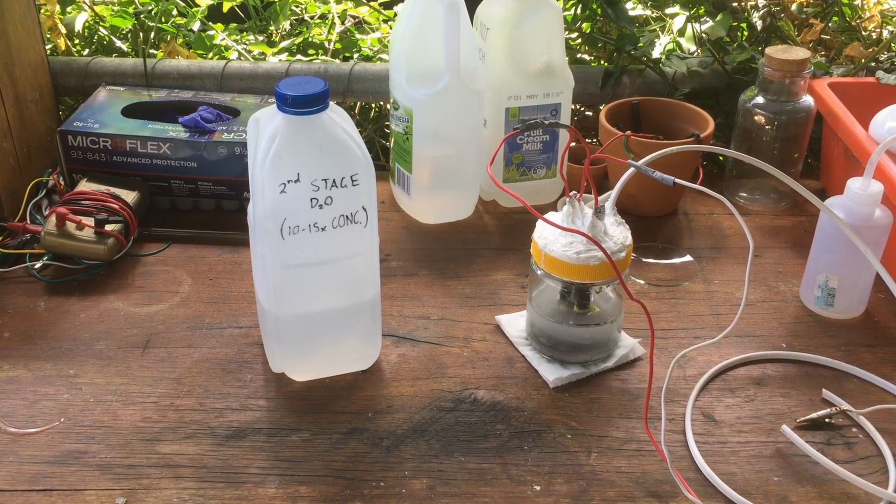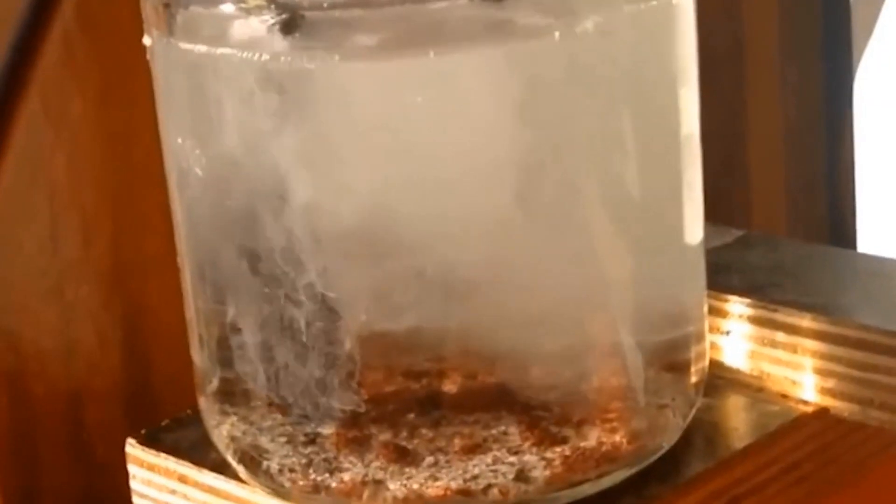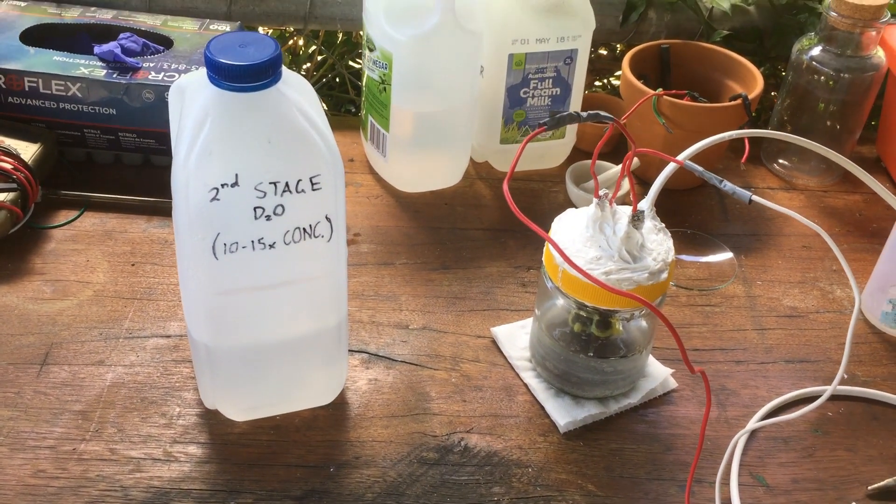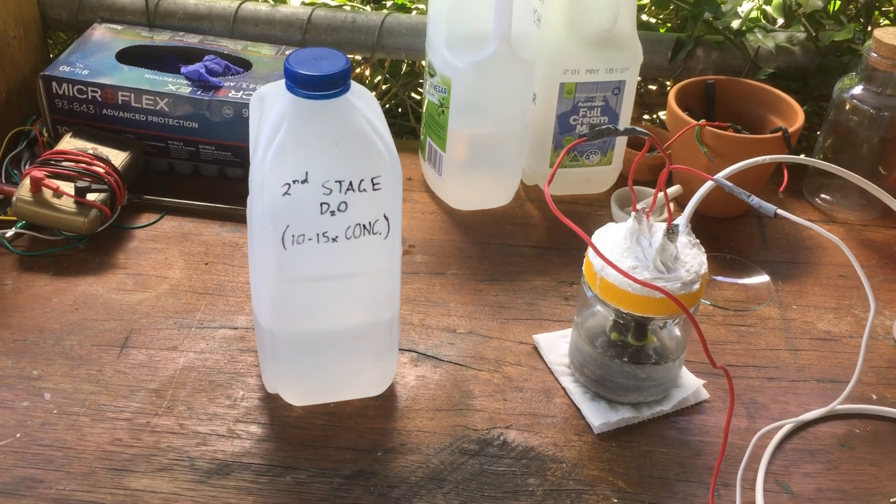Hi guys, Harry here. Welcome to Scrap Science. Welcome to the next installment of the heavy water, or the deuterium enrichment series.